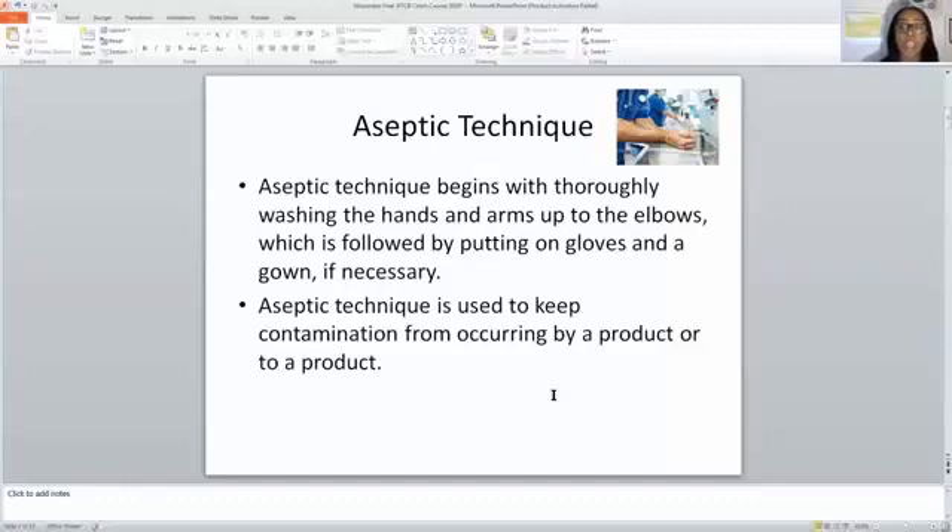When you are washing your hands, one of the things to remember is to say your ABCs during the hand wash. Wash all the way up to your elbows, then dry your hands with a lint-free paper towel. Aseptic technique has been used in the pharmacy to keep contamination from occurring from one product to the next. It's really important, especially when you're doing sterile compounding, that you are using aseptic technique.